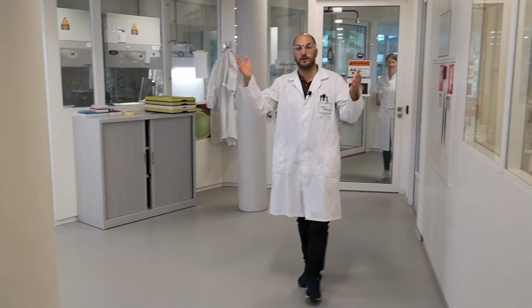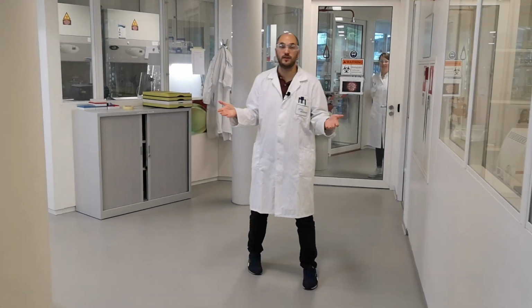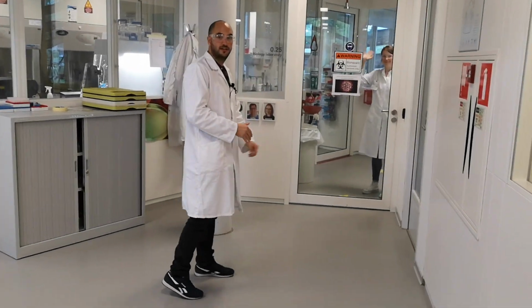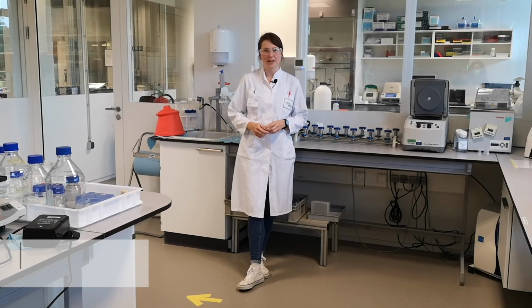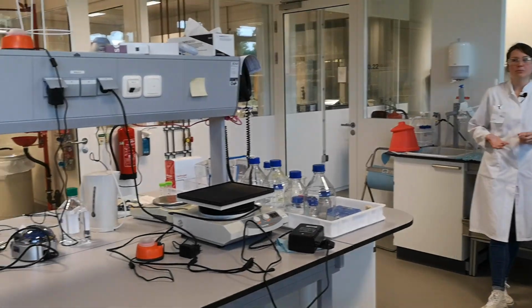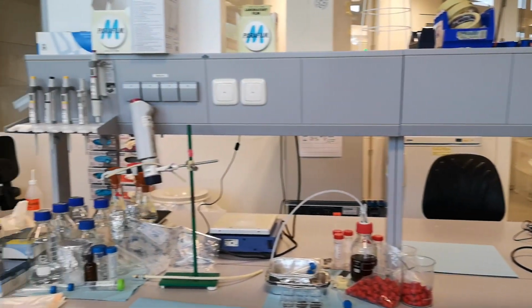So we have visited our microscopy lab, our experimental hall, our analytical lab, but as Wetsus is a multidisciplinary research center, we also have a multi-equipped microbiology lab, which not everyone can access though. Olga is waiting for us inside to give us an introduction. Hello everyone, it's me again, Olga, and now I would like to show you our microbiology lab. Our microbiology lab consists of two main rooms. In the first one we do our basic microbiology, where we prepare media, we grow our bacteria, we work in sterile conditions.